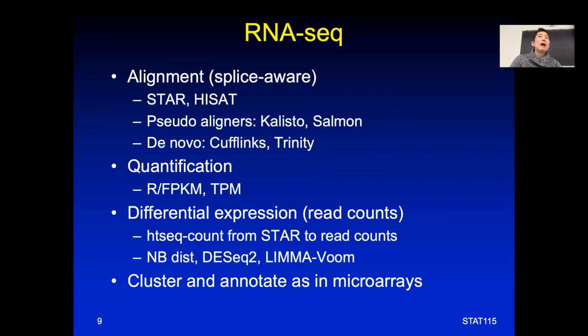I want to mention, most of the time, you will get a good result if you do annotation with, I would say, over 200 genes. If you only get 50 differentially expressed genes, it's very rare that from DAVID, you will really get some very significant pathways. And so if you don't have enough genes to run, like if you only get 36 differentially expressed genes, what you could do is lower your cutoff a little bit. Previously you might say I'm using fold change of 1.2 and FDR of 0.05. Maybe you say, sorry, fold change is the log 1.2, or you say two-fold change or something, right?